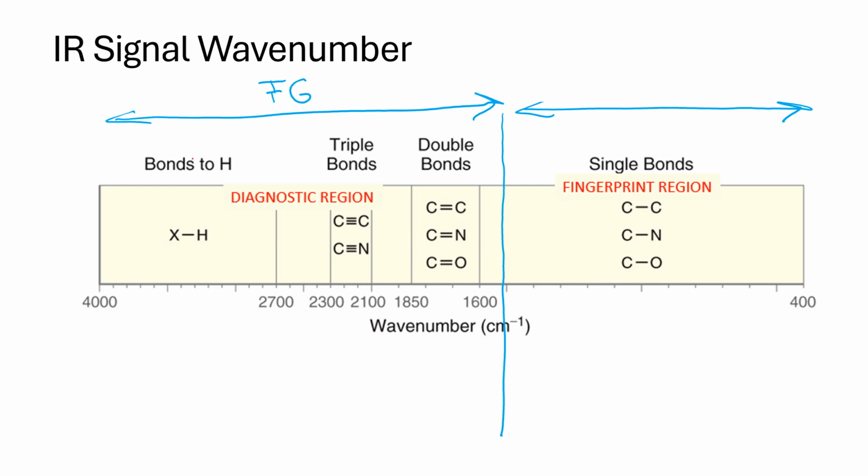I want you to see that essentially all of the hydrogens attached to any atom, being nitrogen, oxygen, or carbon of different hybridization, are going to be showing above 2800. But typically when I am analyzing a spectrum, I draw a line at roughly 3000 centimeters -1, and this is 1500, and that's where I draw my line. I'm going to be looking about that, and all of the H's bonded to something are going to be around, or a little lower or above, 3000.